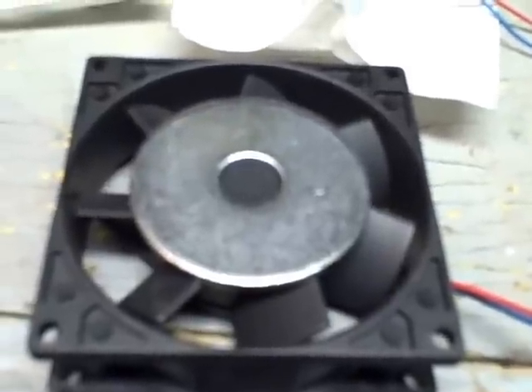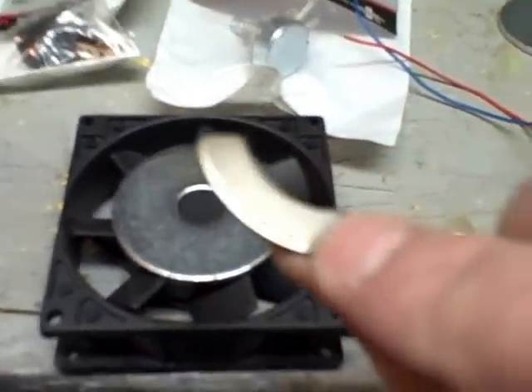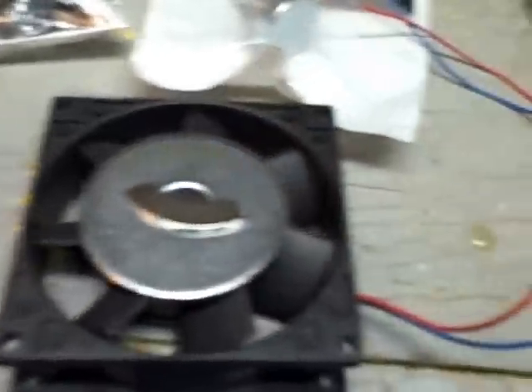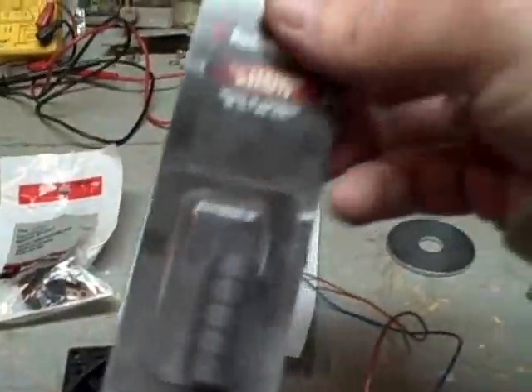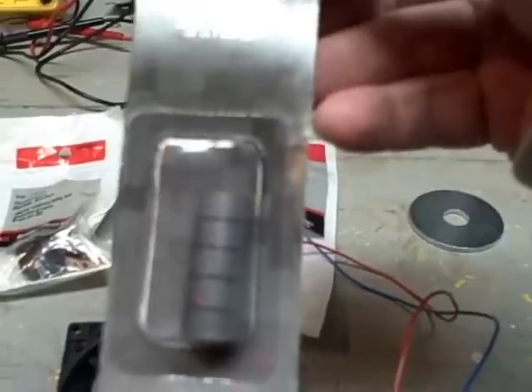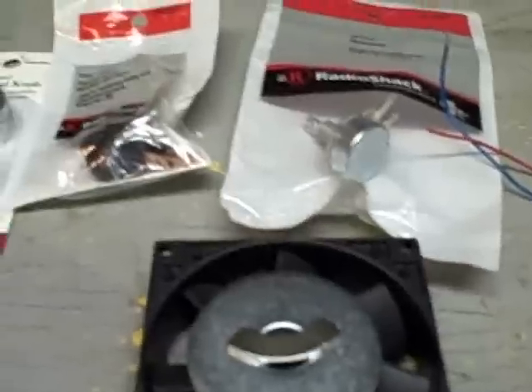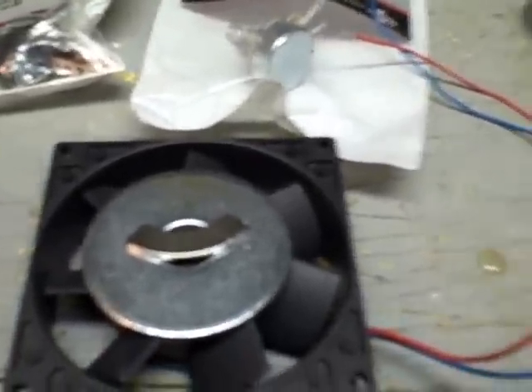This is a magnet out of a hard drive that I took out today. A lot of people are using those, but I've read that it's kind of hard to get them balanced and I don't know if this one is quite big enough — it was an older hard drive. I also picked up these ceramic magnets at Radio Shack. I don't know if they'll be strong enough; a lot of people use rare earth magnets which are really strong.